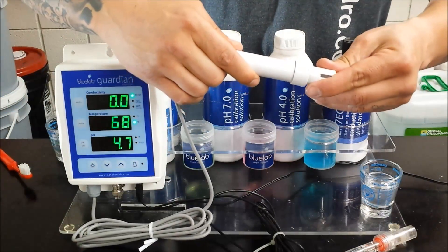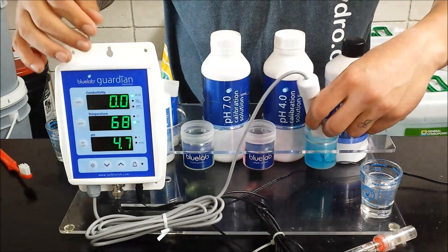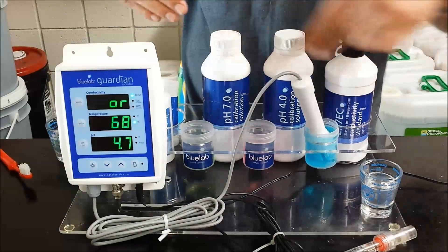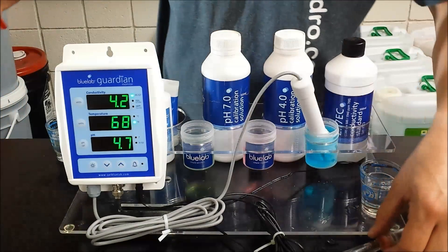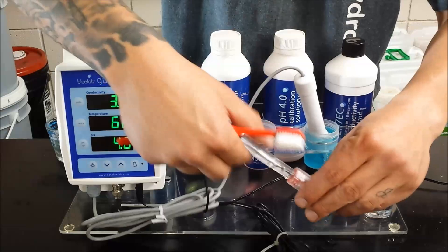Put the shroud back on and this is your temperature compensation so you want to have it in a liquid that's been out in the same temperature as your pH calibration. Always use fresh solution.